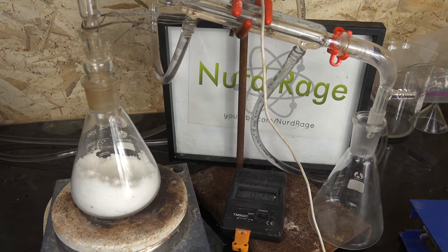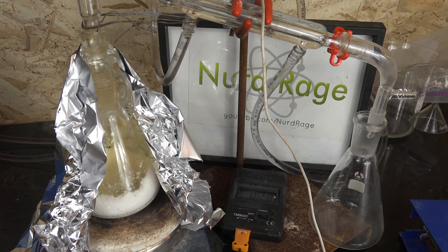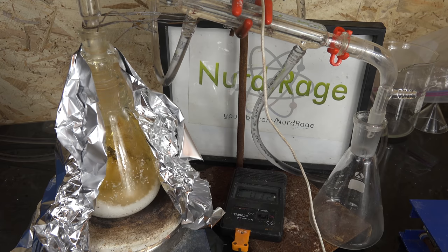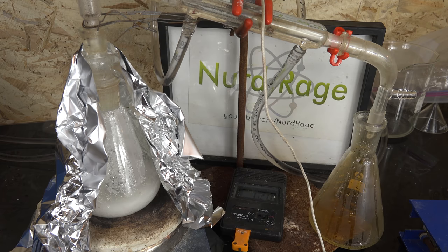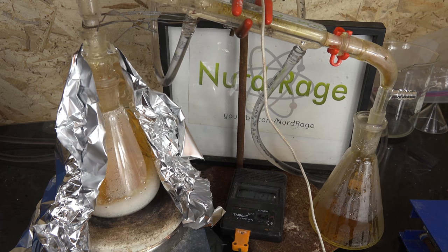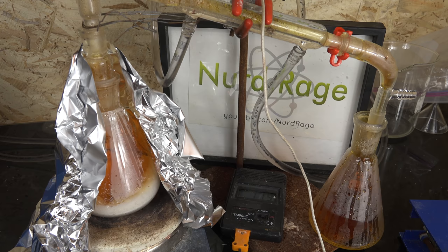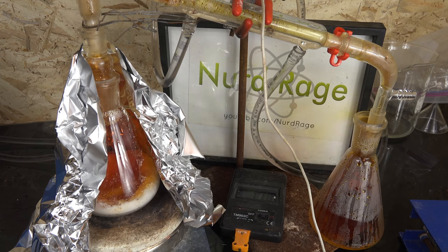Greetings fellow nerds. I've been making nitric acid in various ways these past weeks and so far I've used another acid in all of them, like sulfuric acid. The idea is that we mix a nitrate salt with an acid to produce nitric acid and the complementary salt. Nitric acid is volatile so it's easily distilled off with strong heating. This is a very simple process but very robust and high yielding. Various acids can be used, with sulfuric acid being the most popular, and it's still the standard method to make nitric acid for the amateur. However, I sometimes attempt crazy processes just for the challenge.